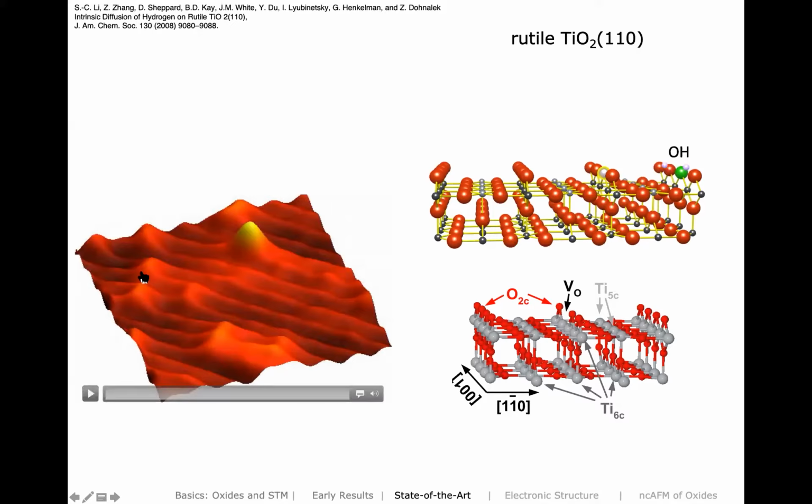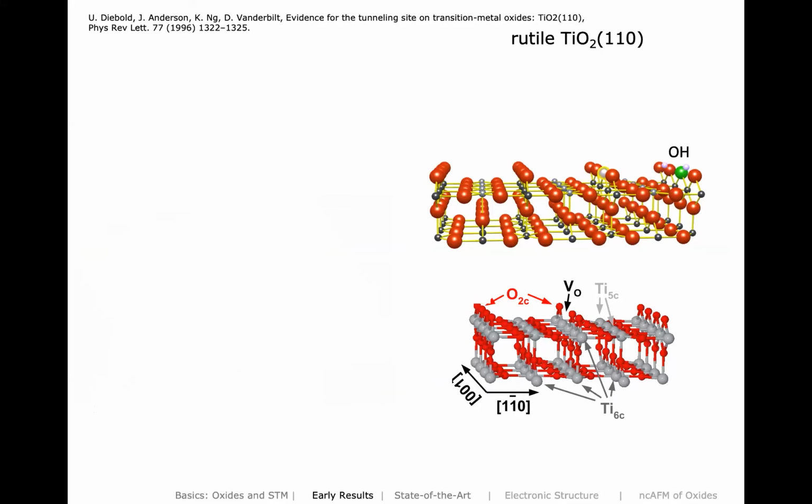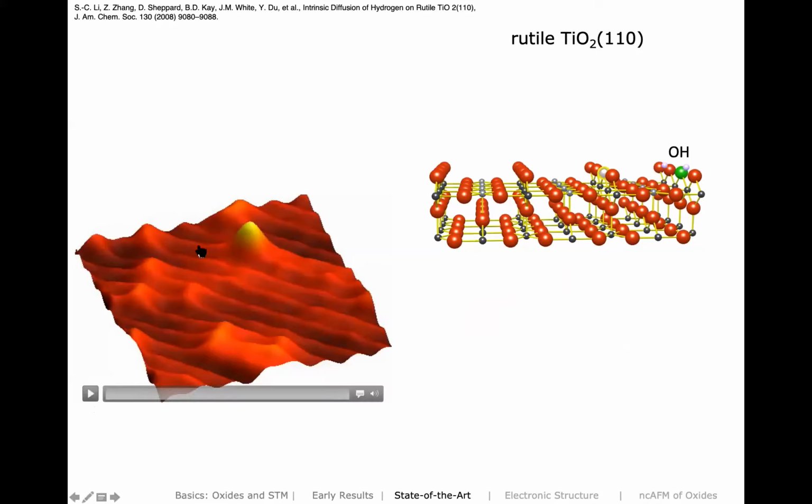And then you have much better images, of course, 10 years later. Here the oxygen vacancies are bright bumps between the rows, and here would be a hydroxyl. In fact, it turns out, to tell you the truth, this picture was not oxygen vacancies, these were all hydroxyls. We didn't have good enough vacuum, so water came and filled up these vacancies immediately. Now, Xiaochun actually took a movie, an STM movie, where a water molecule comes, meets oxygen vacancies, and then they diffuse apart. So this was about intrinsic diffusion of hydrogen on rutile.